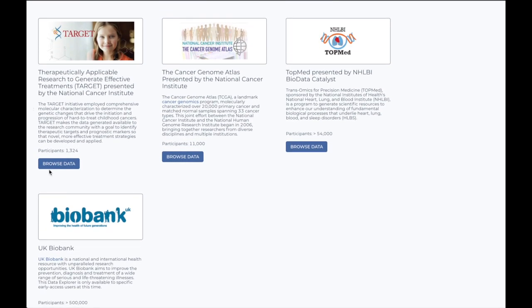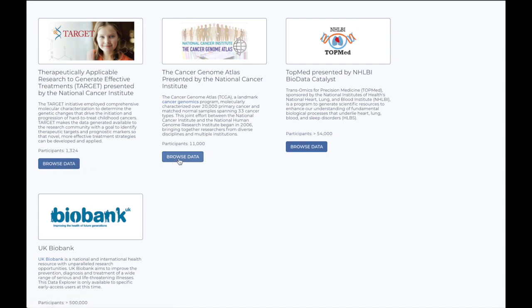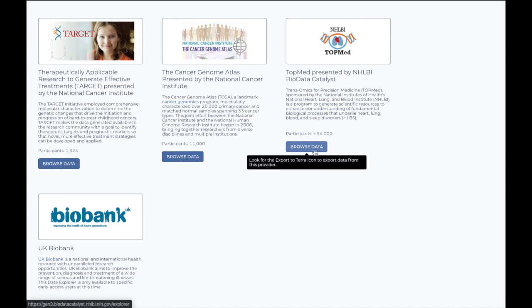If you're authorized to use restricted access data, such as data stored in Gen 3, you can link your credentials to your Terra account from within your Terra profile.